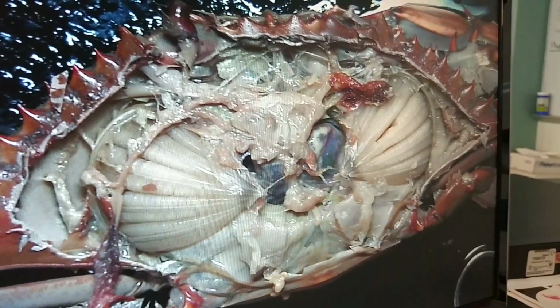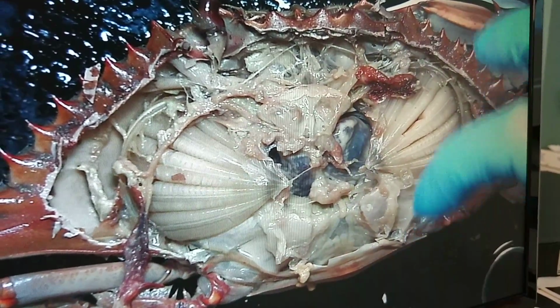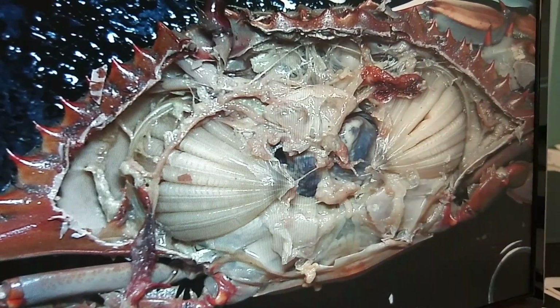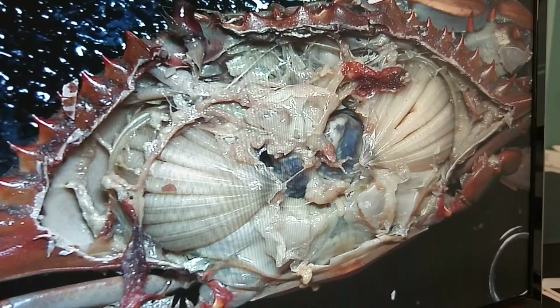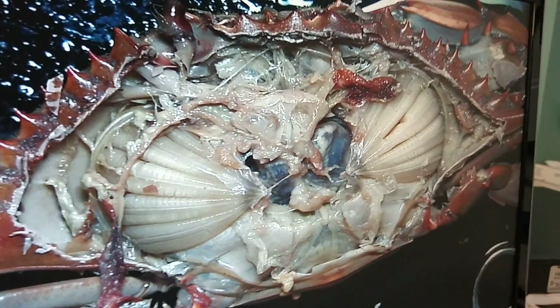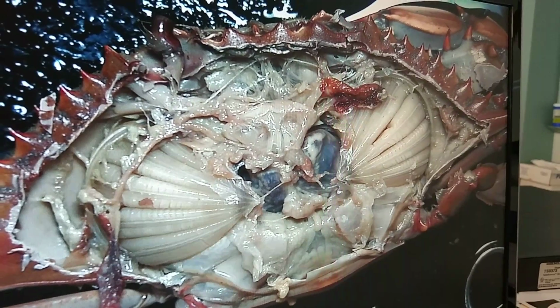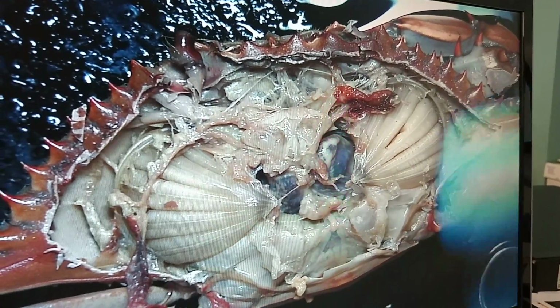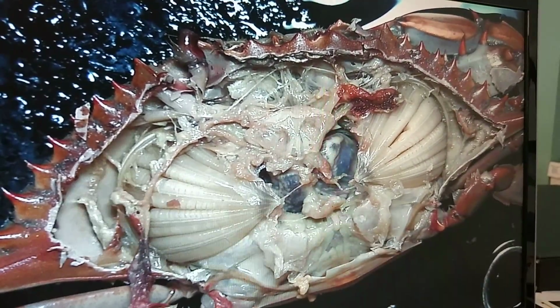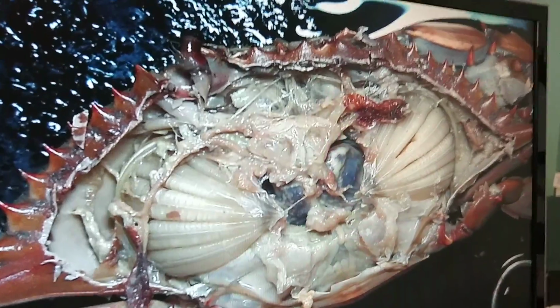So think about just reproductive. Do you guys remember how these guys reproduce? I know you guys talked about it, right? They spit their eggs out their mouth, or is that a different animal? I don't know how they reproduce. Right, so they brood them, but how do they get fertilized eggs in the first place? Broadcast spawn. So just in general, right?